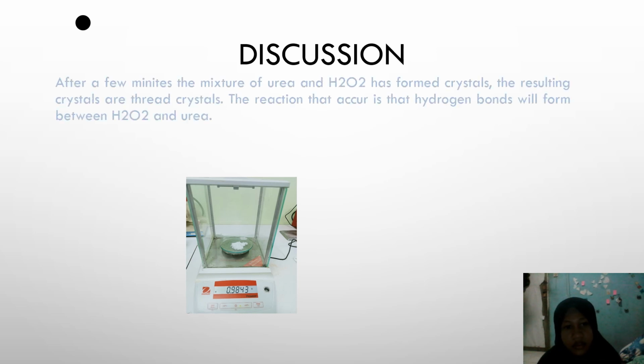After a few minutes, the mixture of urea and H2O2 has formed crystals. In the resulting crystal, hydrogen bonds form between H2O2 and urea.